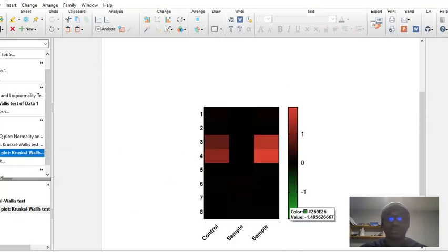And this is your heat map. As you move higher, that's how it reduces. When you come down, it's higher here in your samples, and as you move, it reduces. The zero mark here is minus, and here is plus, so it increases, and decreases in all your samples.